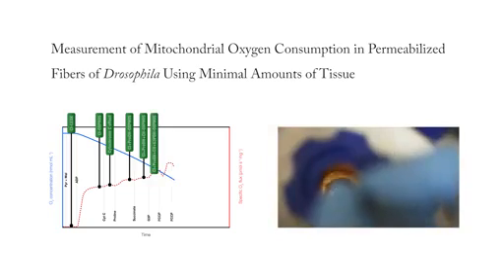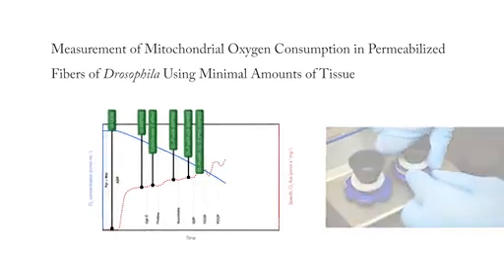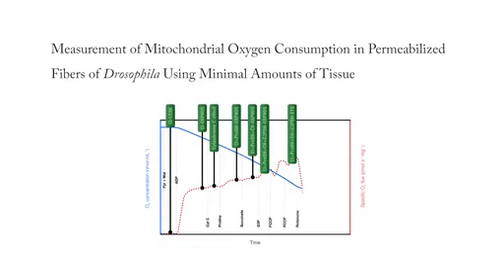The thoraces are then transferred into the chambers of a respirometer and mitochondrial oxygen consumption is measured with a combination of different substrates, uncouplers and inhibitors.